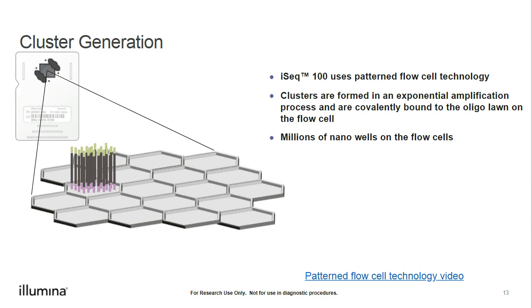And if you have any questions about how pattern flow cell technology works, this is probably my second favorite YouTube video resource that we have, this pattern flow cell technology video. It's really helpful, second only to the SBS chemistry video, which is also another great one that we have.